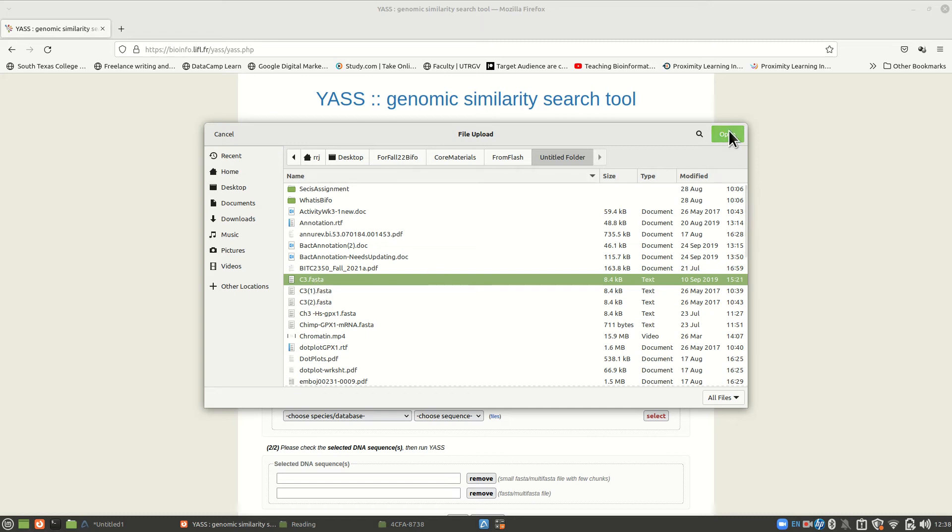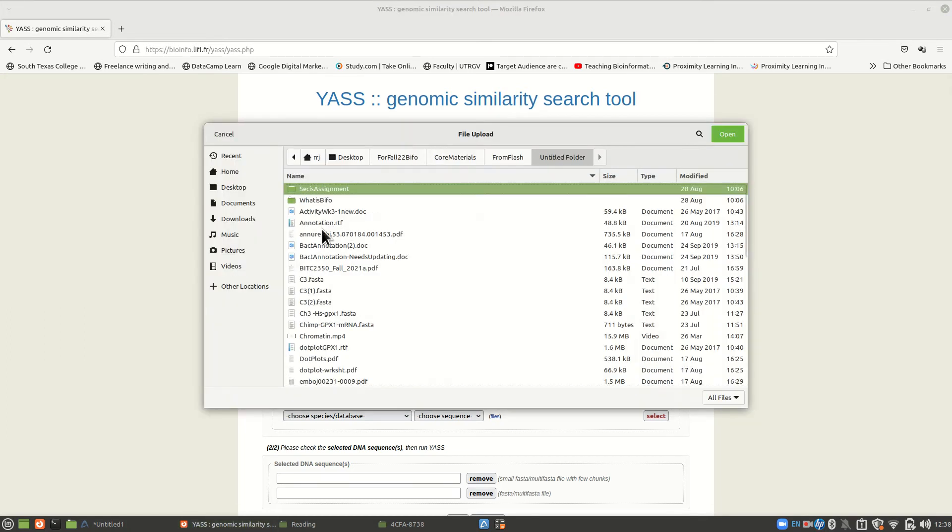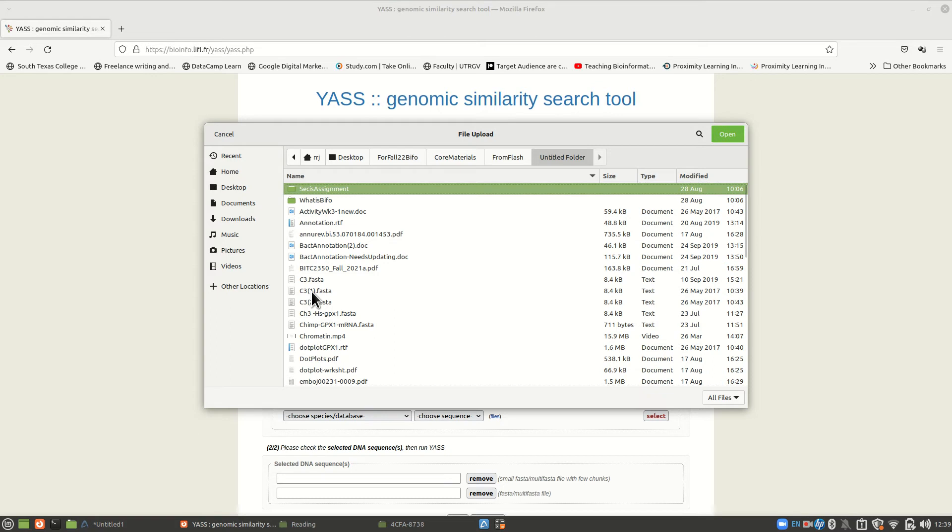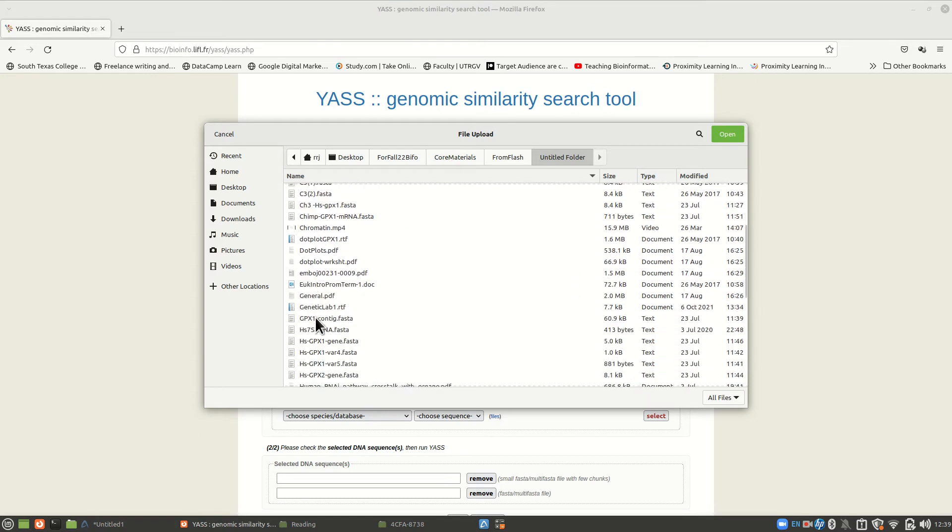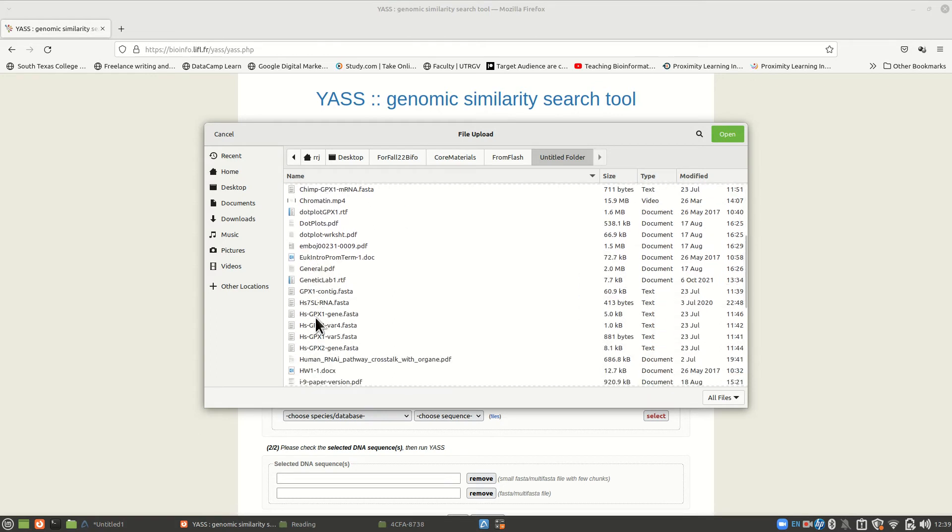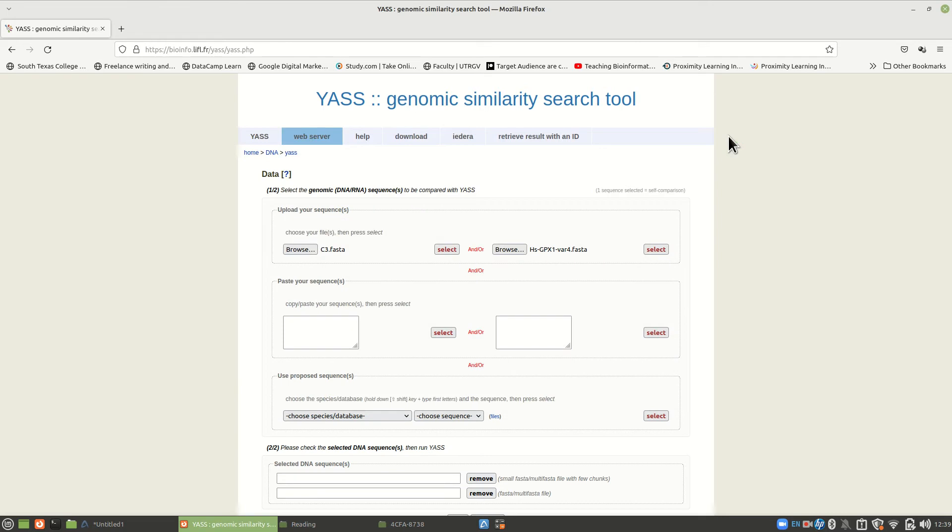Here we go. We will grab the C3. This is the one that has the two genes on it. One of them being GPX. So I put that one in there, and then I'm going to browse. And we're in the same place. This is the same one. Here's the chimp. Maybe something that might be a little different. Let's just throw in GPX-1 variant 4.